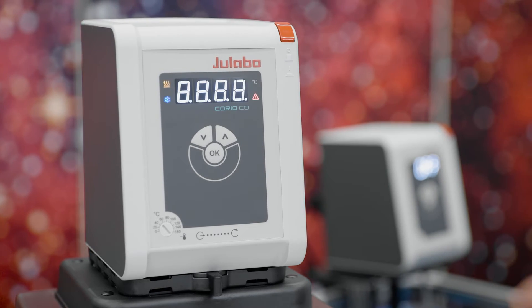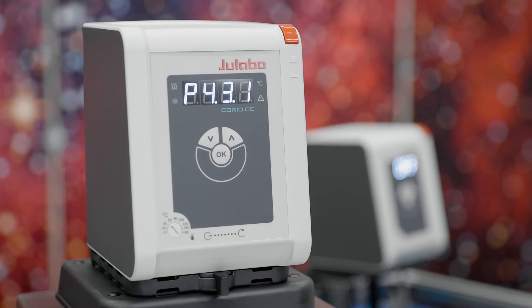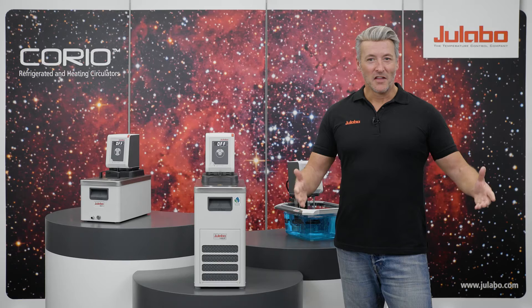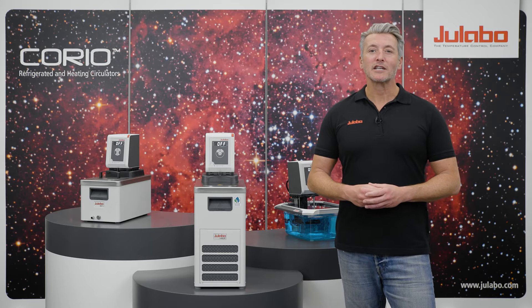The device is conveniently switched on and off via the main switch. At startup, all display elements light up briefly while the software boots. The default setpoint temperature is 10 degrees Celsius.